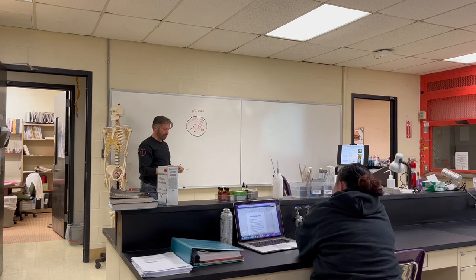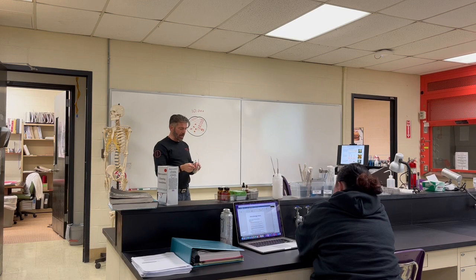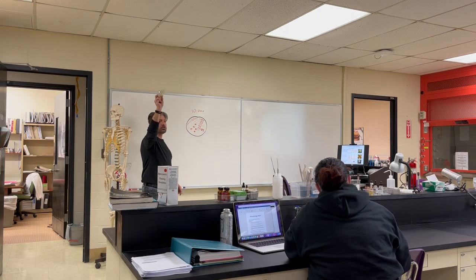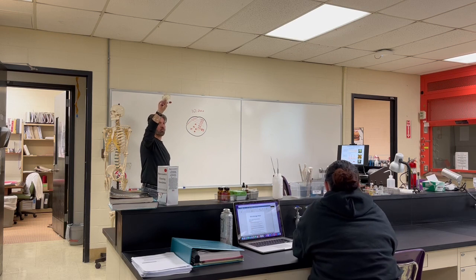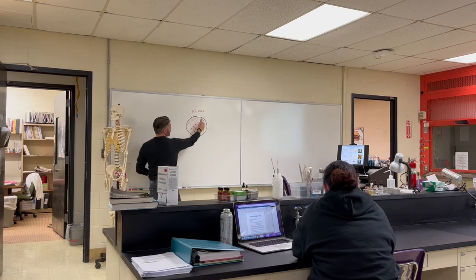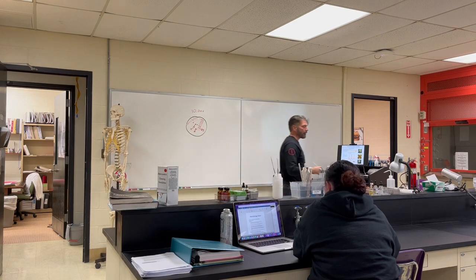But what would happen if I had a mixed culture or I swabbed something from here? Do I know whatever's in that quadrant is one single bacteria? No. So in theory, when I go through here, there could be different bacteria that get deposited here singularly, and they could grow on their own.